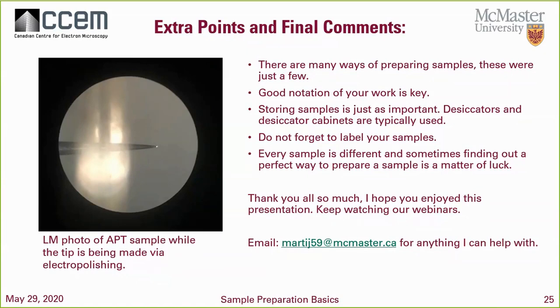And every sample is different. Sometimes finding out the perfect way to prepare a sample is just a matter of luck, especially in wet polishing. Preparing those samples at an angle is extremely, extremely tricky, and sometimes finding the right angle for that right application is extremely, extremely hard. So just keep that in mind.